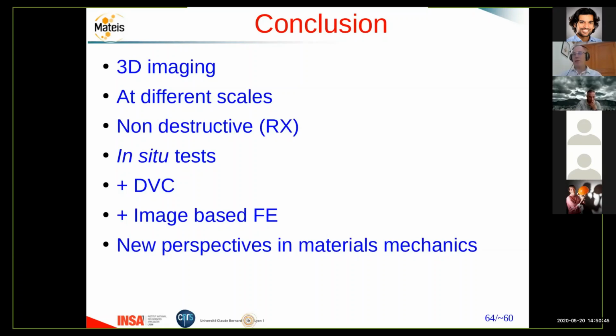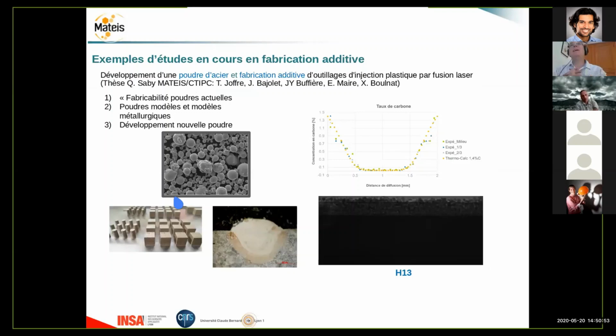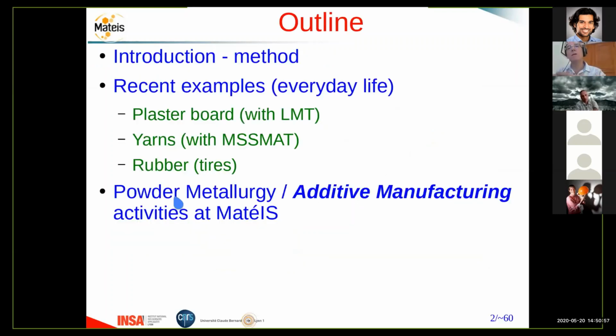Yes, it will never be dynamic enough to be at the time scale that all these people interested in soil versus rubber adhesion would like us to make the experiments. This is not possible. So this is going to be quasi-static loading.